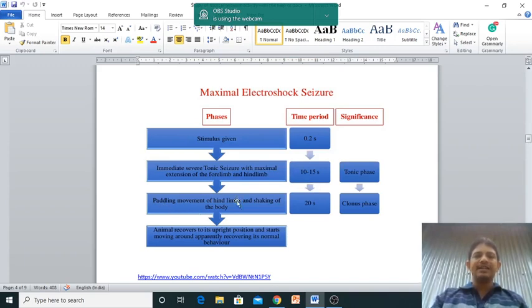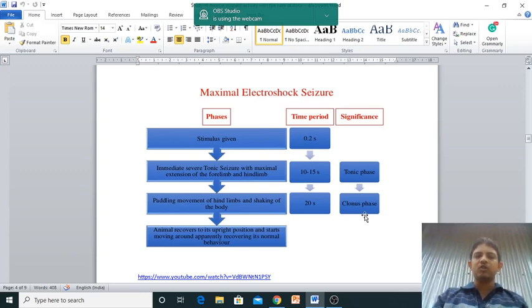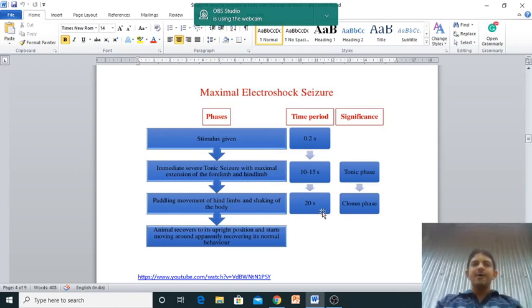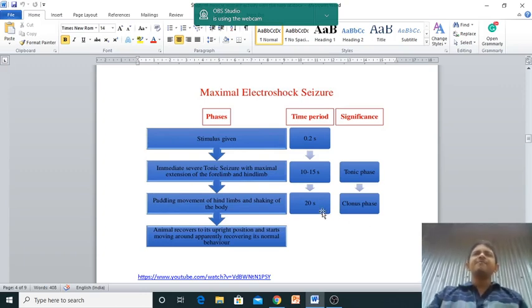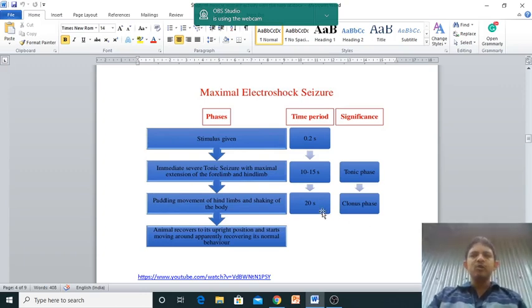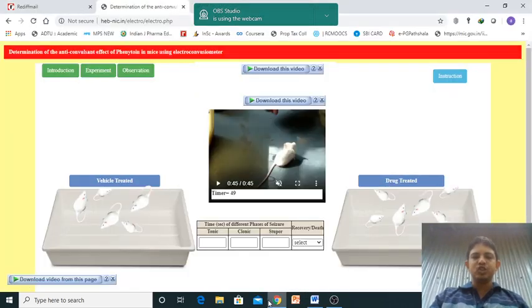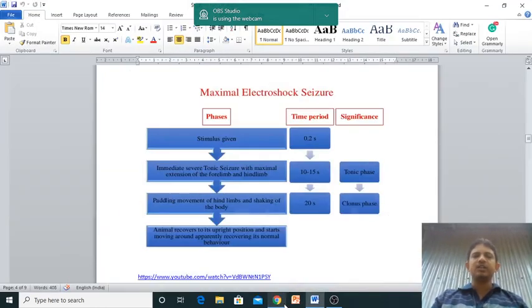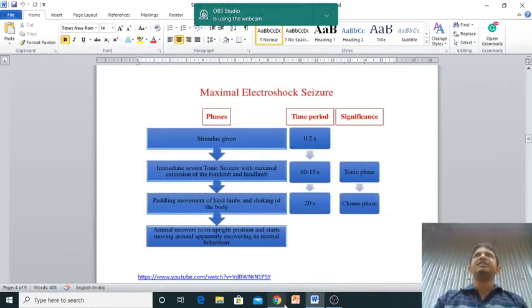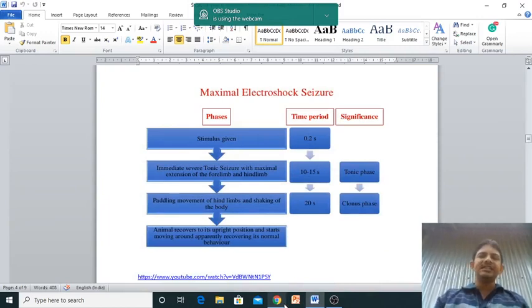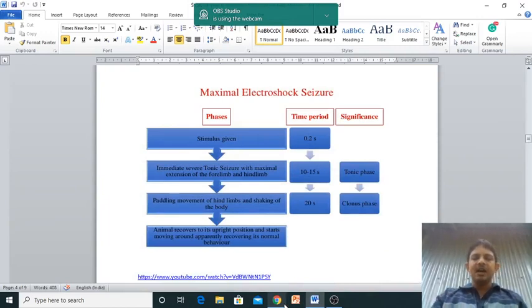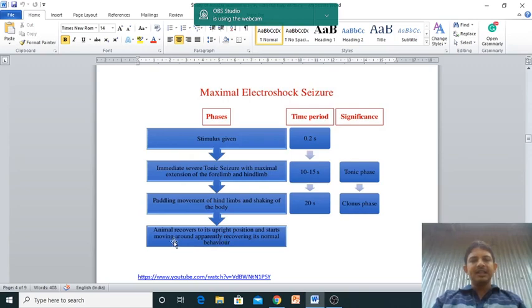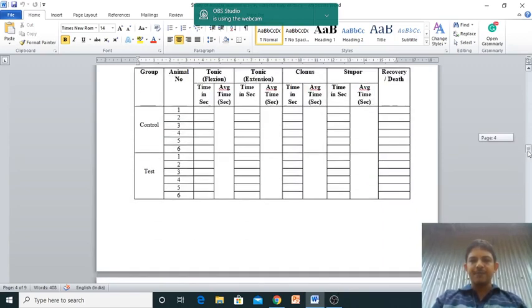Next is pedaling movement of hindlimb and shaking of the body which is known as the clonus phase, up to 20 seconds. Then you can find the stupor - it is nothing but sleep-like position just before the recovery, and then it recovers in the upright position.